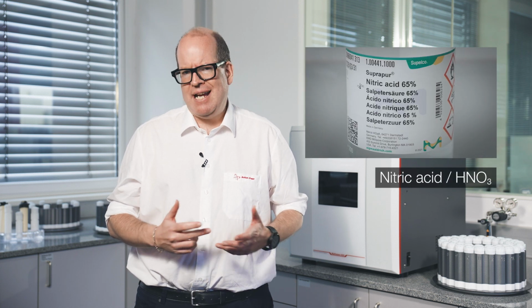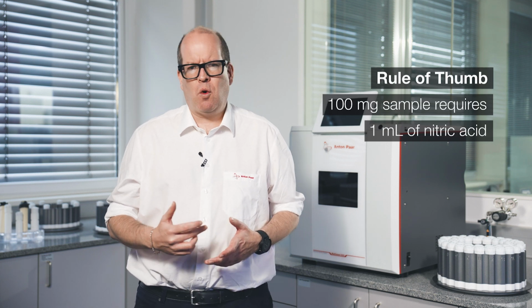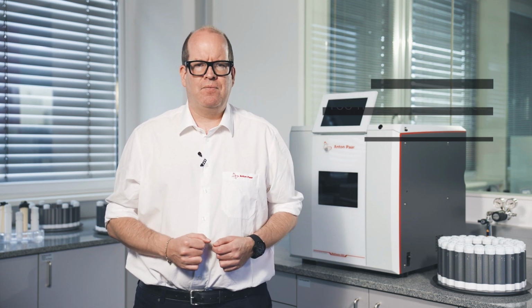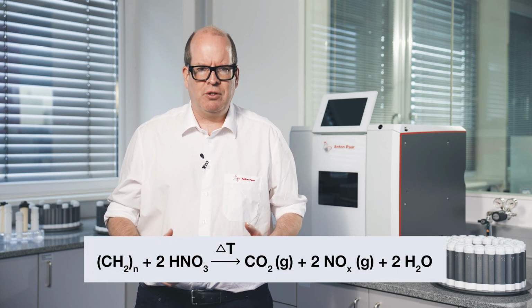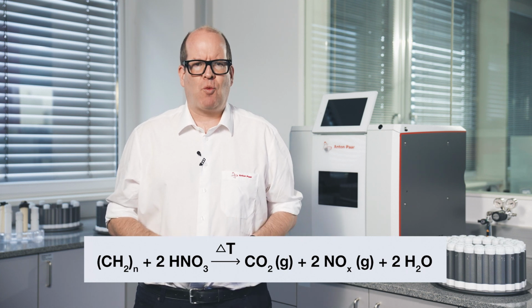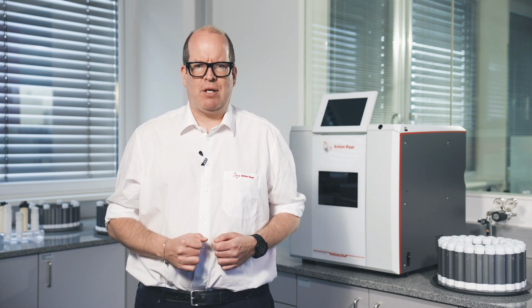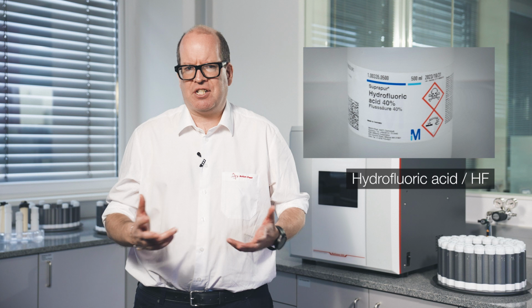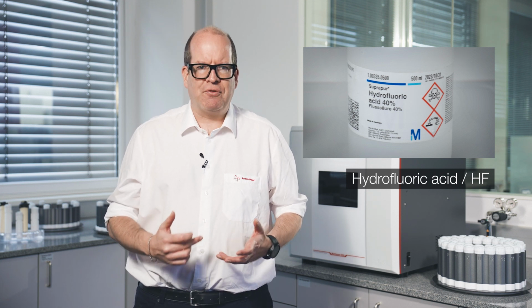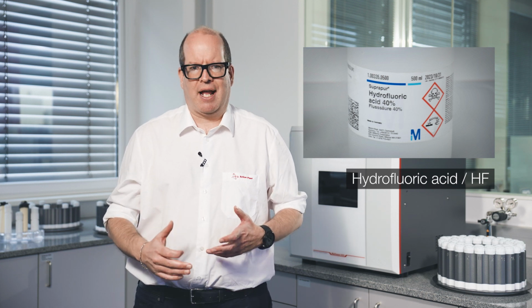Organic samples require mainly nitric acid for digestion. As a rule, 100 milligrams of sample require 1 milliliter of nitric acid. As we saw earlier, nitric acid oxidizes all the hydrocarbon bonds to ultimately form carbon dioxide and water, as well as nitrous gases from the acid. In addition to nitric acid, in some special cases, other acids may also be required. Hydrofluoric acid. Some organic samples may contain silicate. The only acid that can dissolve silicates is hydrofluoric acid, and so the addition of small amounts of hydrofluoric acid may be necessary.